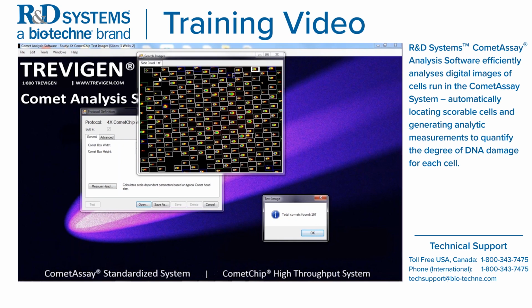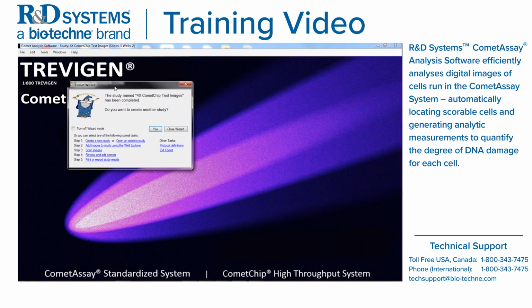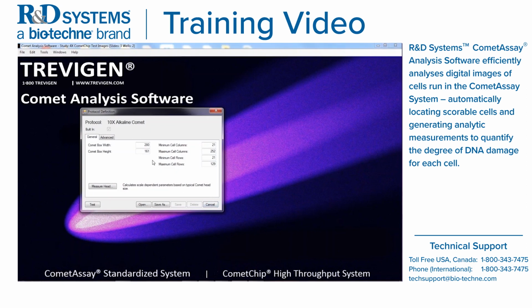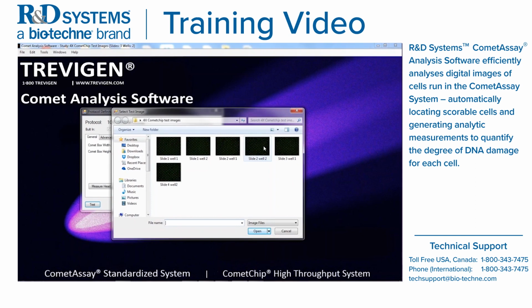All right, so let's do an example where let's test a protocol. You can also get to these protocol definitions with the wizard. So let's go back. Now, my test image is at 4x, but we also have some default protocols suitable for 10x. So let's try the 10x alkaline comet protocol and see what happens. Well, this box width and box height are much larger for this protocol. But let's go ahead and test our image again. Again, take an image that has some damage in your comets. Let's open up your image file.